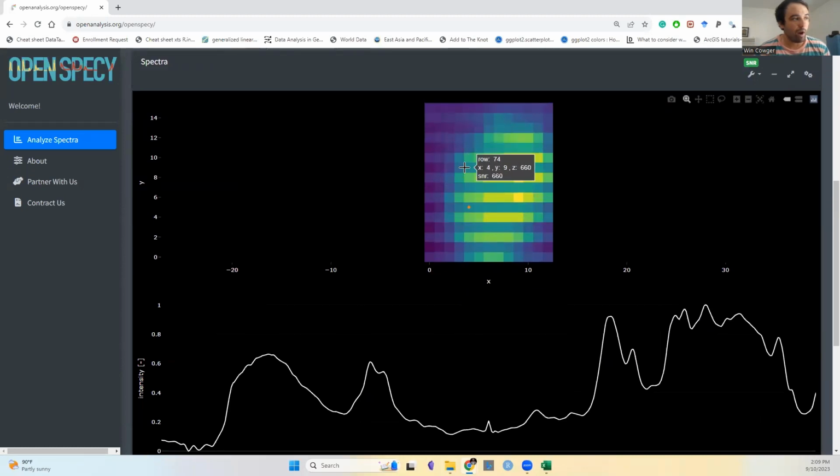And with this, I'm trying to find where the threshold is. I know that there should be a particle here in the middle. I know that because I already looked at a photograph of where the particle was imaged. So all I need to do is reference this against that photograph and figure out where to assign my threshold. I'm doing this with one particle right now, but you could do this with hundreds or even thousands of particles simultaneously.